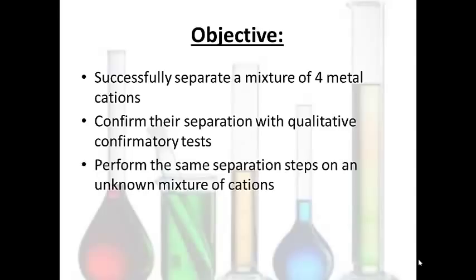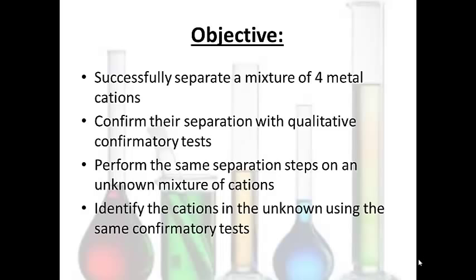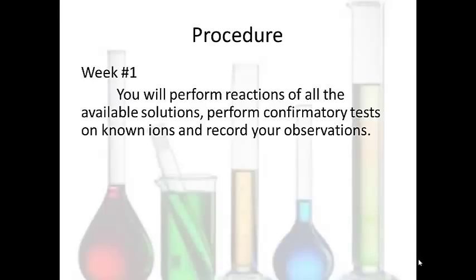And once you have the separation scheme, you will perform the same set of separation steps on an unknown mixture of cations and identify which cations were contained in the unknown. In week 1, you'll perform reactions of all of the available solutions, perform the confirmatory tests on the known ions, and record the observations for all of these different reactions.